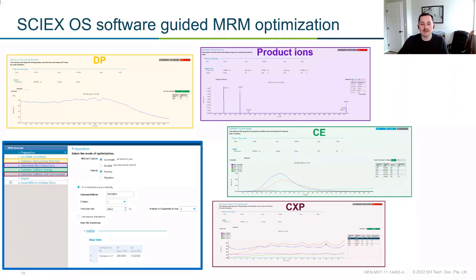The reason I kind of bring this up is even if you are choosing an automatic workflow, which again, great, you just want to be a little bit wary since we are using something like a syringe pump to actually introduce the compound into our mass spec. Every once in a while, I'm guilty of it. I'll leave a bubble behind in my syringe and I'll get a spike in intensity.